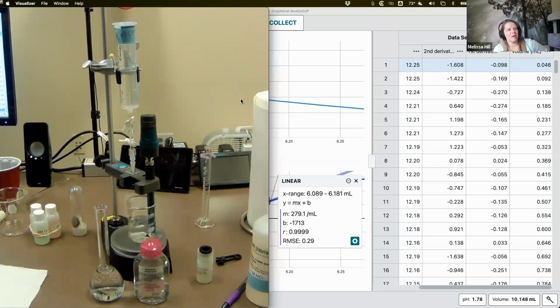So I guess a question came up. How do you differentiate this experiment from regular to honors to AP? I didn't even attempt to do that. I mean, folks, I taught them all, right? We had a chemistry course.